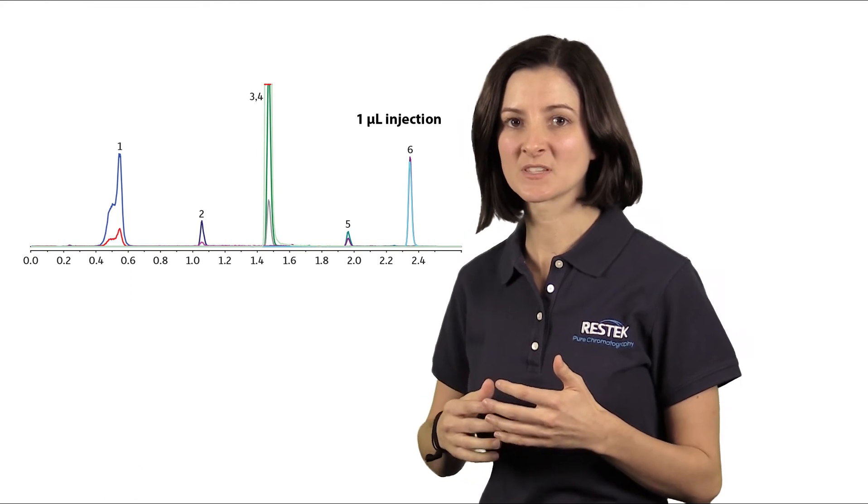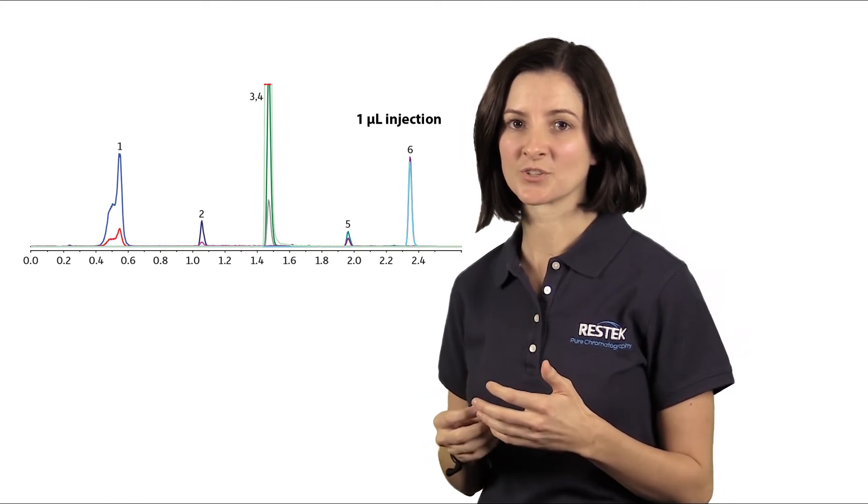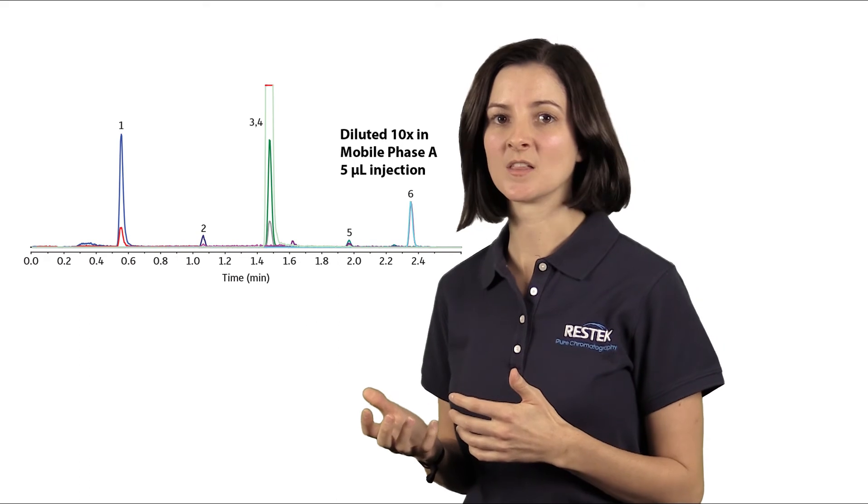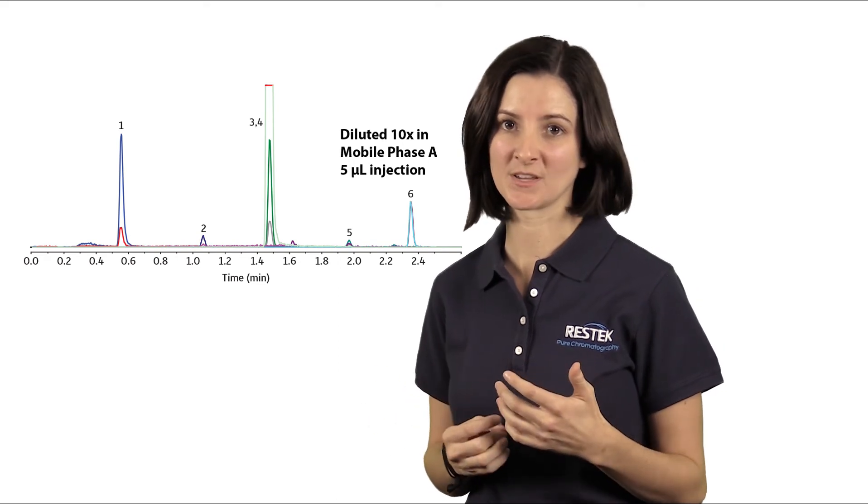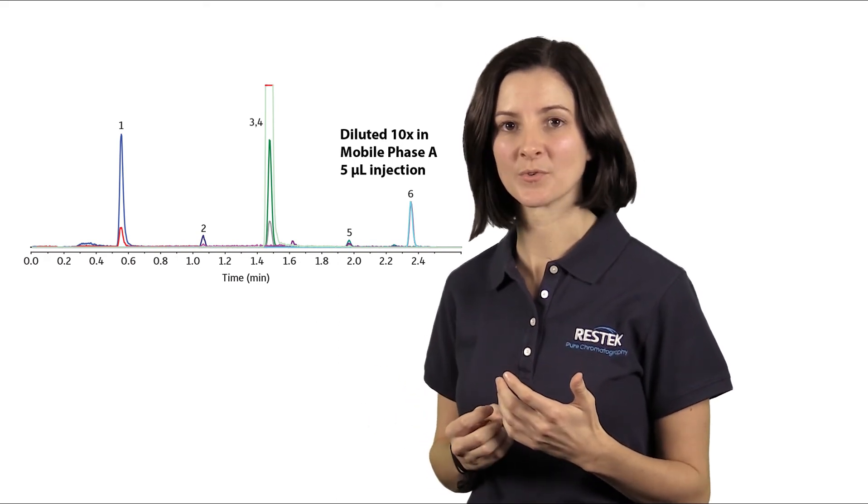Secondly, we can look at changing our sample diluent to match our initial mobile phase conditions. What this does is it avoids that sample and solvent mismatch, and we can start to inject more onto the column without seeing that peak fronting that's indicative of the sample overload.